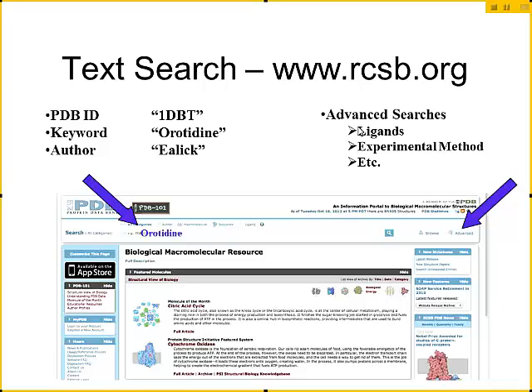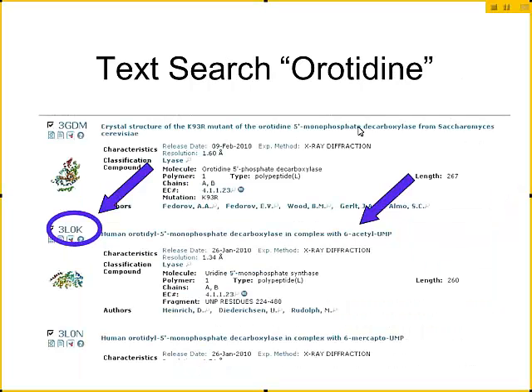You can also search using text words. You can type in the PDB ID, and if you have the paper, that's generally the quickest way of pulling the structure up. You can search on a keyword — for example, if we're going to look at the protein orotidine monophosphate decarboxylase, you can type orotidine at the top. Or you can type the author name, and you can click on advanced searches to filter by experimental method, ligands, resolution, or that sort of thing. If you type in orotidine and hit return, you're going to find probably hundreds of structures listed there.